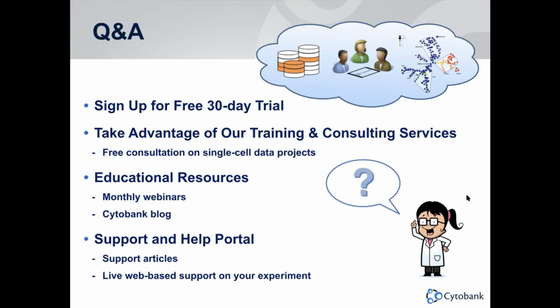So that would be one thing. And then we would investigate if the cells cluster with multiple algorithms. We would actually investigate what the phenotype is. And most likely it would be that the SAM picked it up because of the threshold being slightly different, but actually if there is a biologically plausible explanation for the difference, then most likely it will be picked up by other methods as well. If it's more like an artificial thing that we only find in Citrus, we would consider this basically our over-mining, and we would not take this into account in the future runs. So we never just rely on one method.